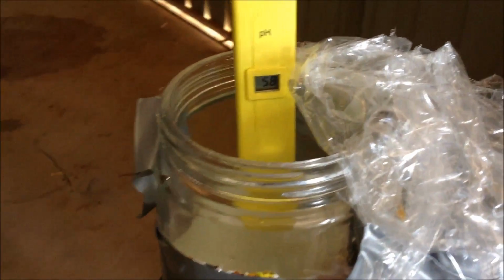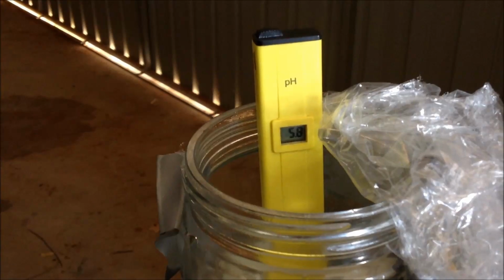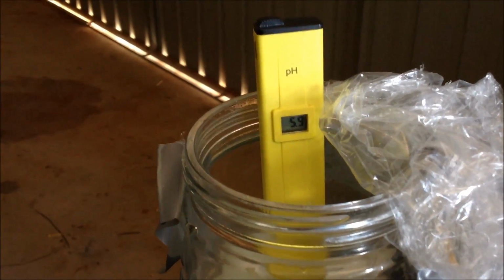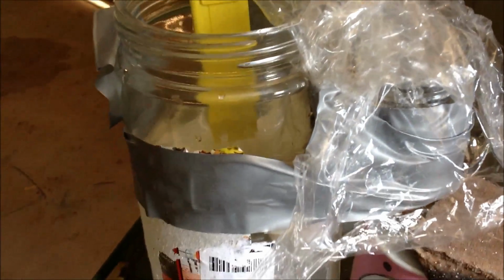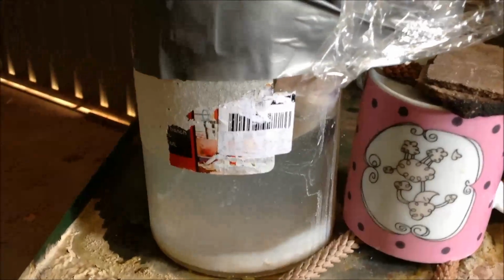Just navigating this. See the pH is up to 5.8, 5.9. So it can progress quite quickly from this point, so it may even go to 8.5 today, so I'll need to keep an eye on that.